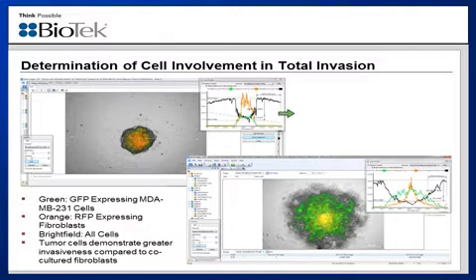However, after 5 days of incubation, when we perform the same type of analysis, it's clear that the breast cancer cells, which you can see with the green line, have migrated to a much greater extent than the fibroblasts. So again, it allows you to get a clear determination of how each co-cultured cell type is migrating in response to the chemoattractant, or chemoattractant and inhibitor, that's been added.